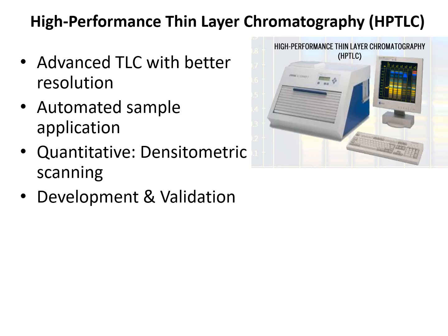Hence, this technique is usually validated using the same protocol we discuss for ordinary thin-layer chromatographic validation. Sample system, solvent system developed, then when appropriate sample solvent system is achieved, the process is validated to ensure it meets up with the scientific standard.